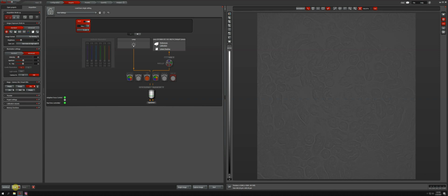The images will be different depending on what optical components you have in the beam path, and therefore can be created depending on, for instance, what objective you're using, if you're using a contrast enhancing technique such as phase contrast or DIC, or even fluorescence. During this tutorial, I will walk you through the shading correction wizard and show you the effect of working with shading correction.